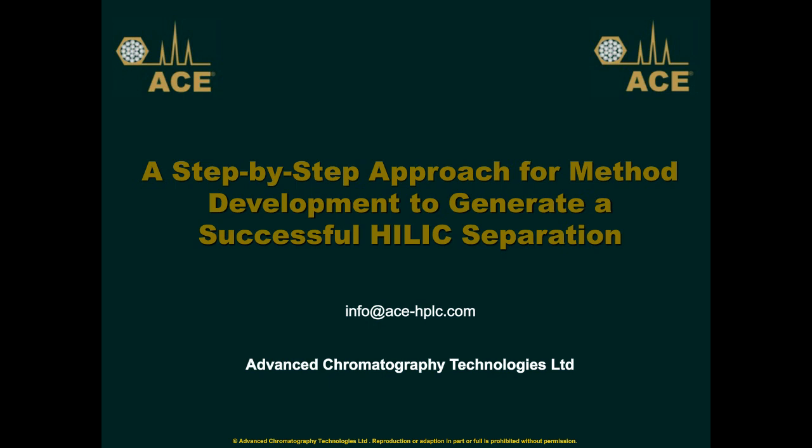And HILIC separations we see are certainly gaining popularity in many industry sectors and application areas. However, we believe that HILIC method development experience in particular is still very low compared to our experience with reverse phase. And there are many misnomers associated with HILIC. So I hope that the following seminar, with its review of the basic principles of HILIC, and hints and tips and tricks, which are well supported with data and examples that we have generated in our lab, will assist you in considering HILIC for your current or future separations. And for those of you who have maybe experienced some hiccups with HILIC in the past, you may look to explore HILIC once more.